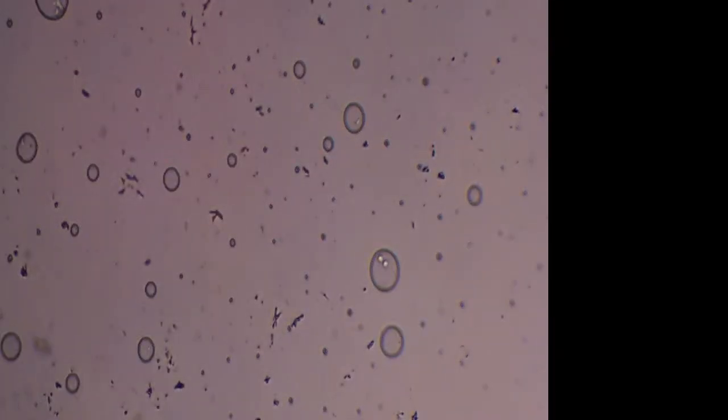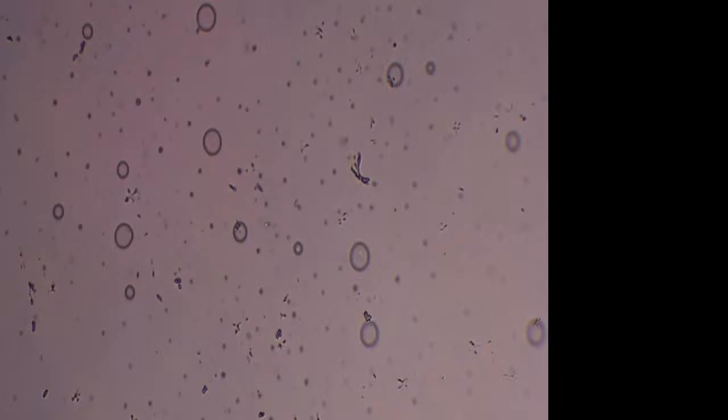Nice bubble field here. More plant material. Is that a dead rotifer? I don't think so. More plant material. More plant material.